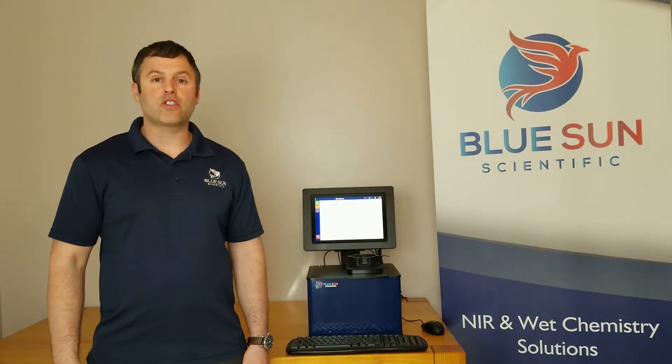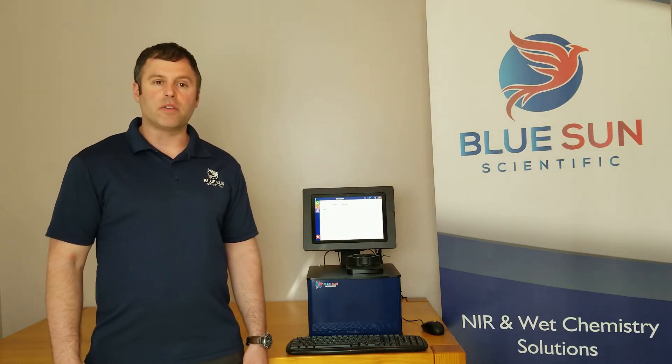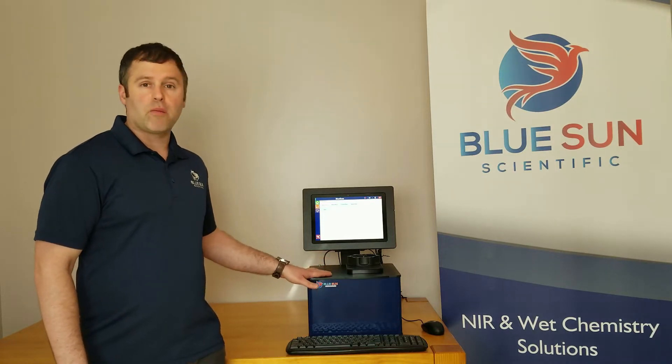Hello, my name is Josh Sarver, and I'm here today to tell you about the Phoenix 5000 NIR analyzer from Blue Sun Scientific. The Phoenix 5000 comes in two configurations. Here beside me, I have the Phoenix 5000 top window model.